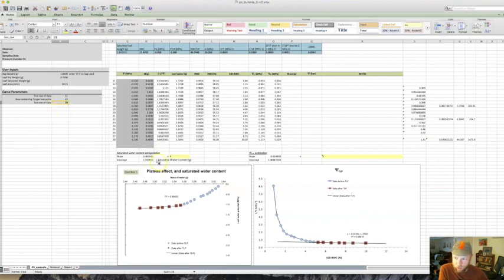But the last row, you would think it would always be your last row of data, but what can happen with your data is sometimes, even though you keep losing water, so you get more points off to the right, the water potential can actually start going the other way a little bit. And that's because if there's lots of collapse of the cells, the xylem water could be kind of released from some of the vessels and apoplastic water can get in there, so you can actually get an increase in your water potential at the very end. And so you have to watch for that, and you might remove a couple data points if they look like the line is actually going back up or flatlining.